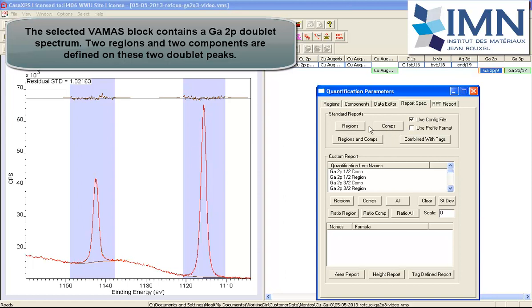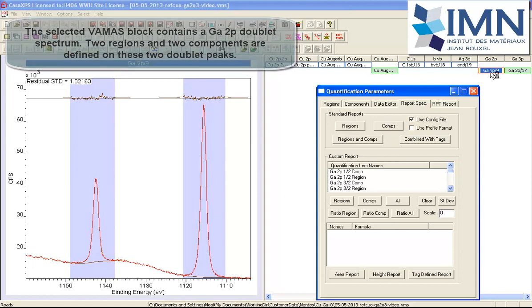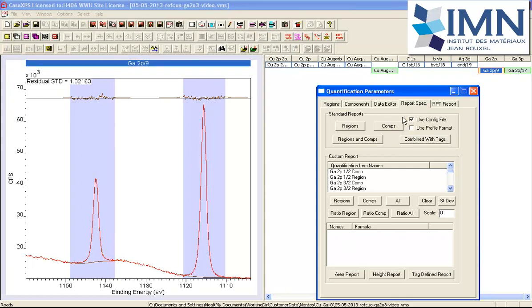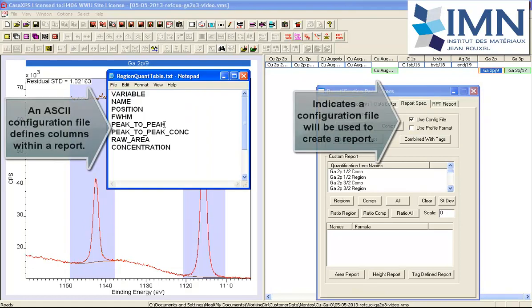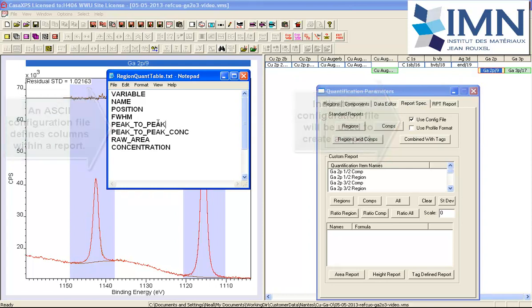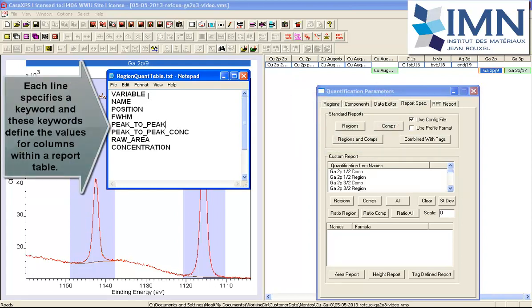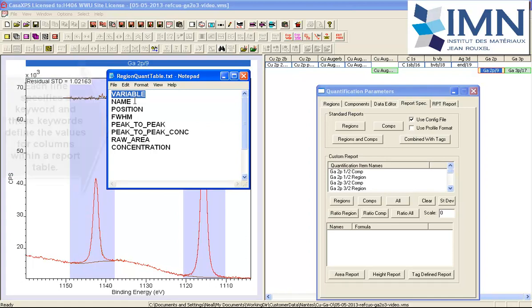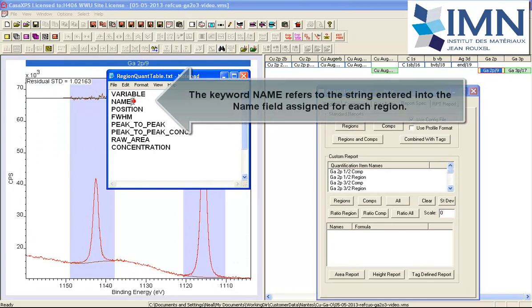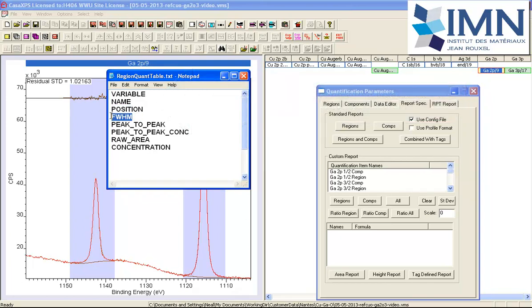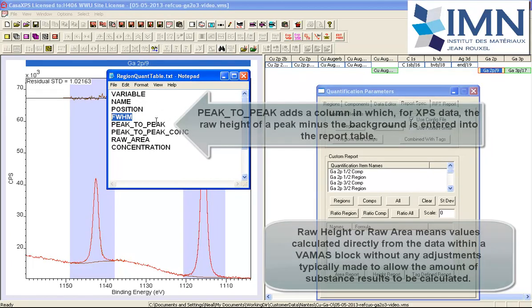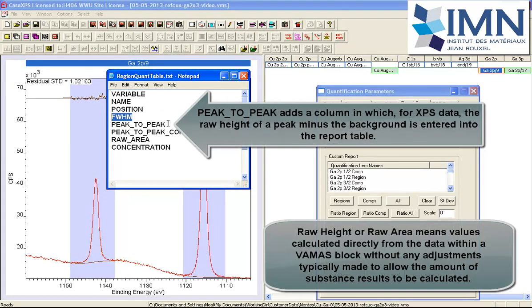Now a table generated from the selected VAMAS block will be formed based on the information in a configuration file. This is an example of a configuration file that is set up for regions. When the regions button is pressed, we should expect to see a column corresponding to a variable that will be the experimental variable for the VAMAS block. The name will be taken from the region, the position that is calculated, full width at half maximum calculated.